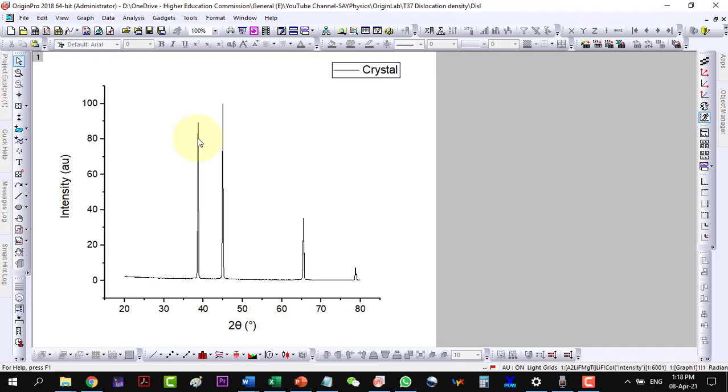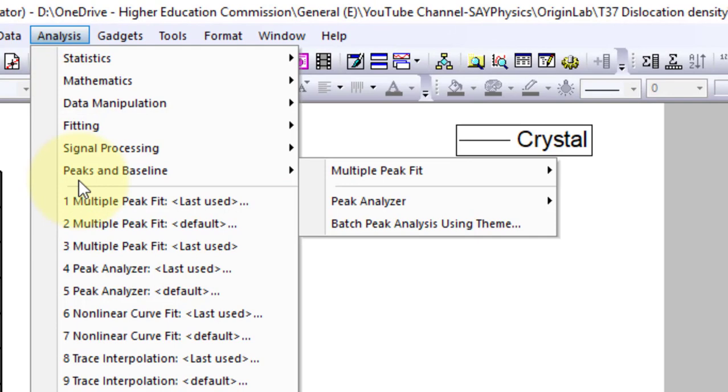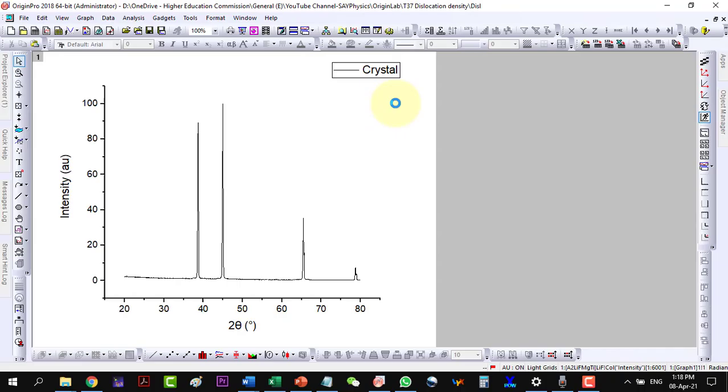I will now find the position of peaks and full width at half maximum values. Let us go to Analysis, Peaks and Baseline, Multiple Peaks and open the dialog.